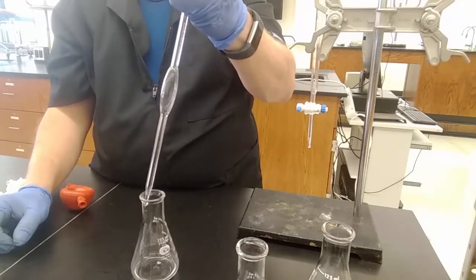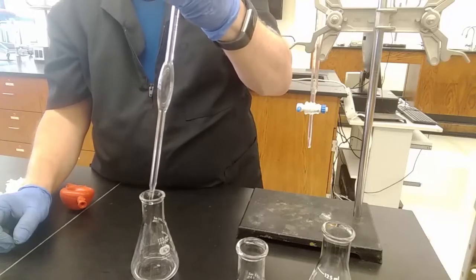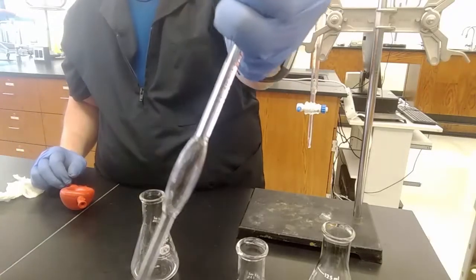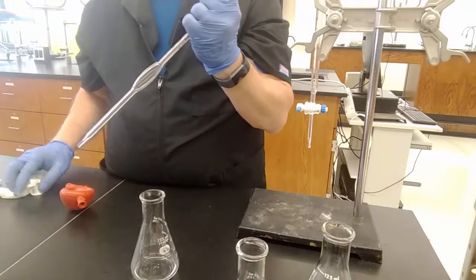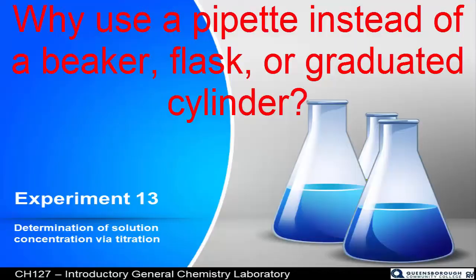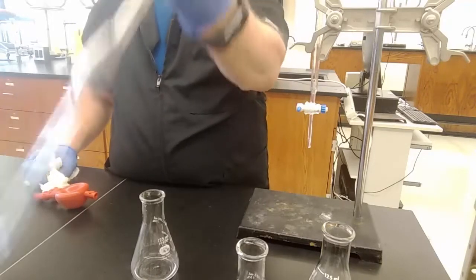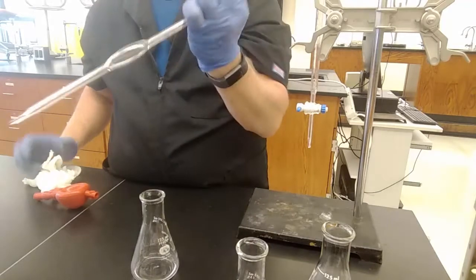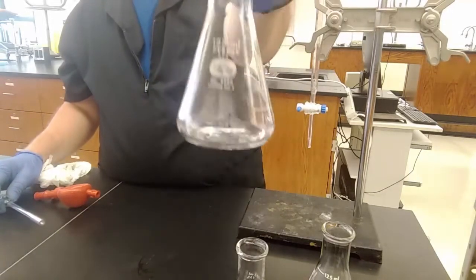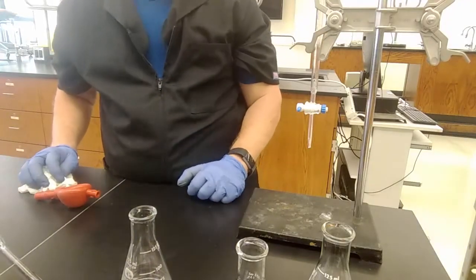So, to answer the question in the book, why is it necessary to use this pipette instead of a beaker or a flask or even a graduated cylinder? The answer is because this is plus or minus 0.02 milliliters. A beaker is plus or minus 5%, and then a graduated cylinder, even a good one.